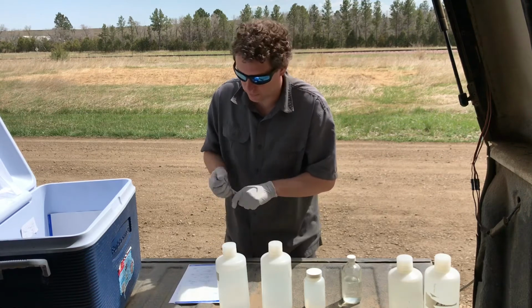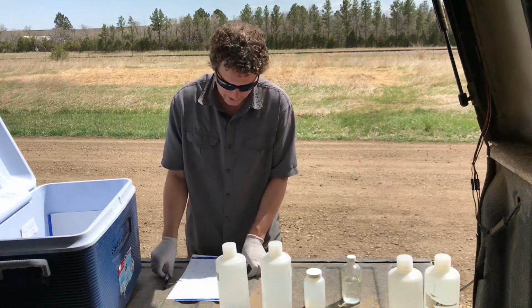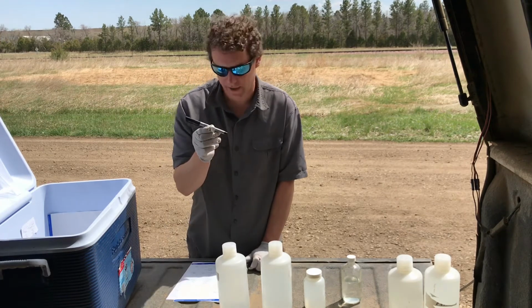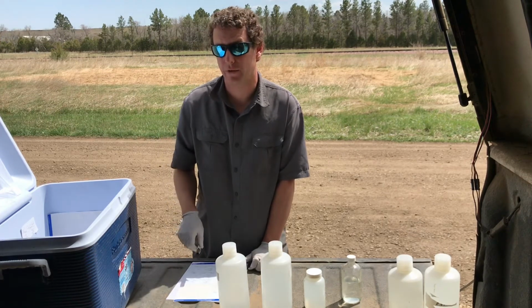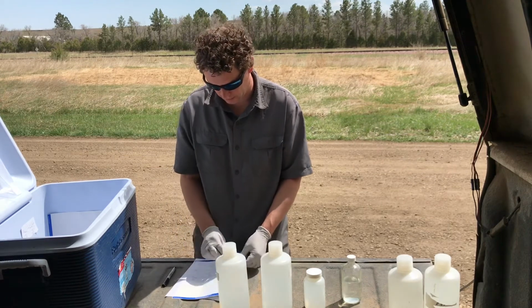And these are waterproof labels, so we do not need to tape over the labels. And if you use a fine tip Sharpie, the ink won't come off your labels even if it rubs on the ice and the water in the cooler. That's okay, that's why we use these labels.